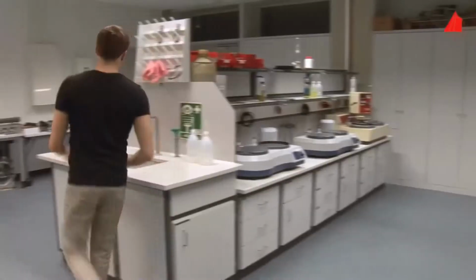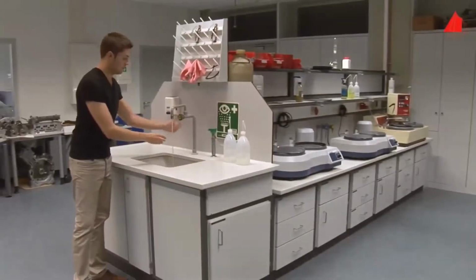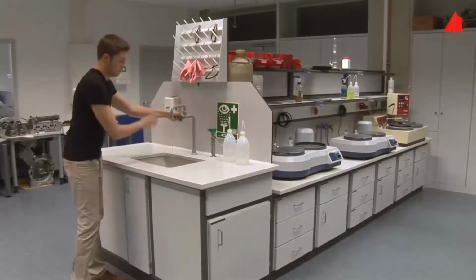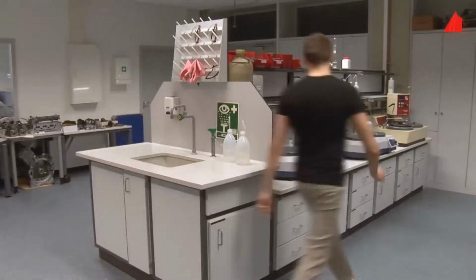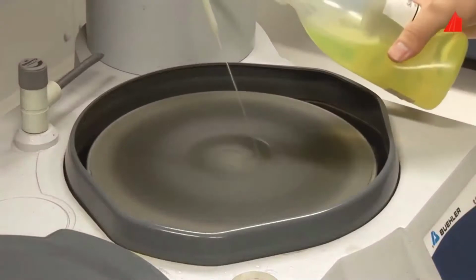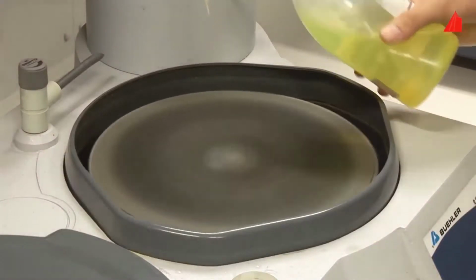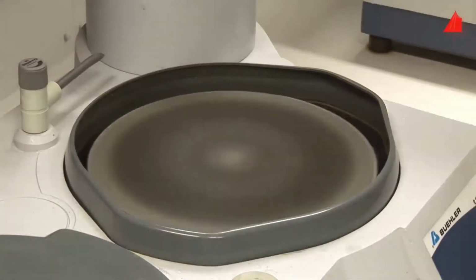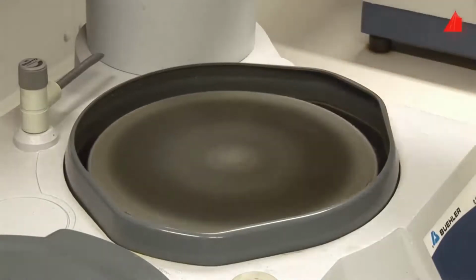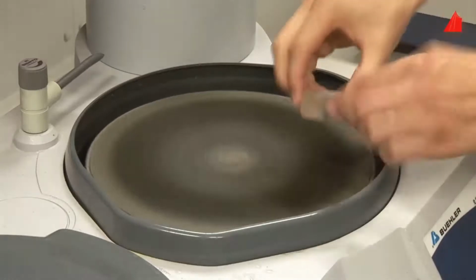Hands should be washed as well so that no unwanted particles find their way to the sample and the polishing cloth. Now the material tester can start with the first polishing operation. He chooses a polishing disc equipped with hard cloth of low resilience, moistens the cloth with a suitable lubricant, and adds 2 splashes of diamond suspension of particle size 6 micrometers.